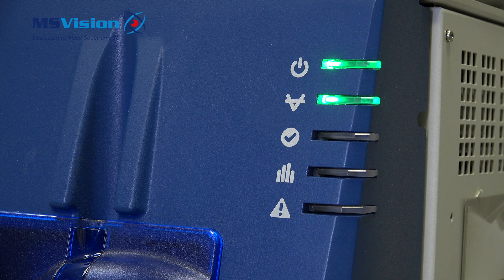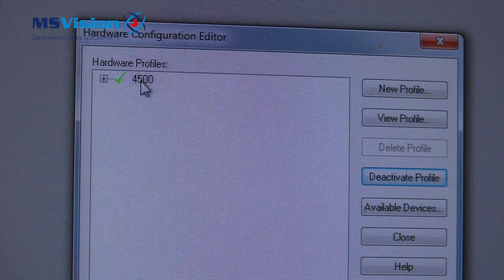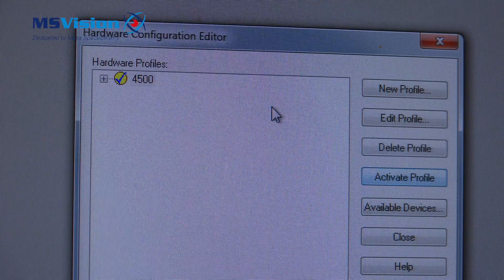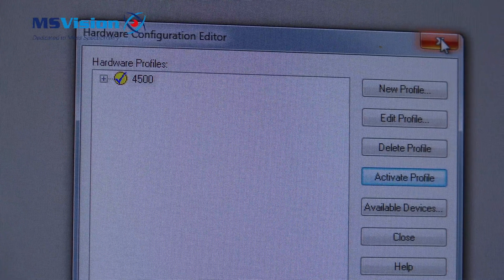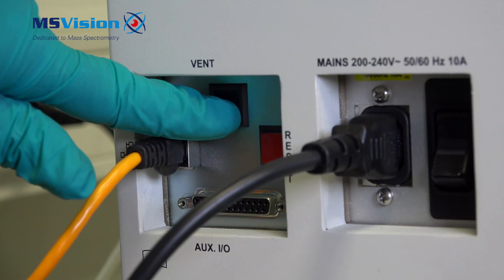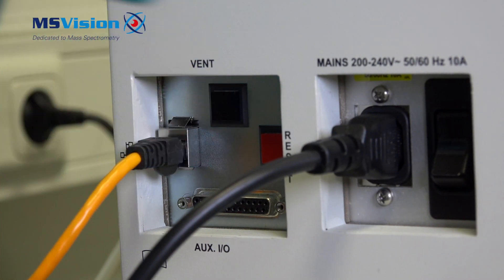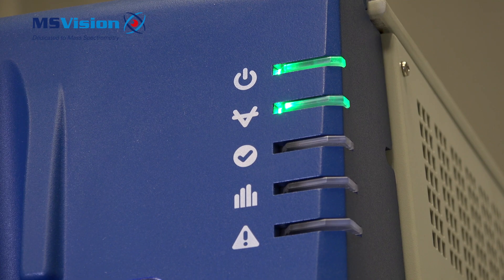To shut down the system, first deactivate the hardware profile. Once this is done, press and hold the vent button for five seconds until you hear a click, the system starts to vent, and the vacuum LED starts to flash.